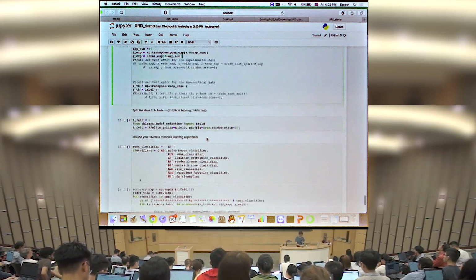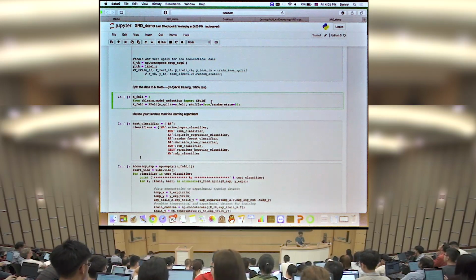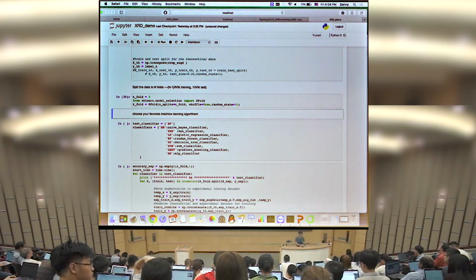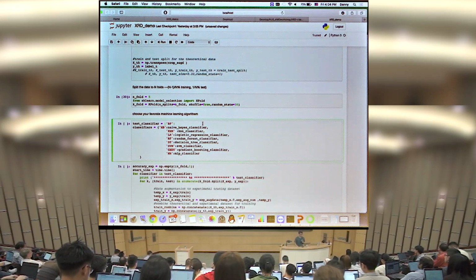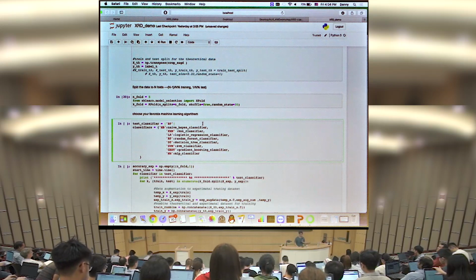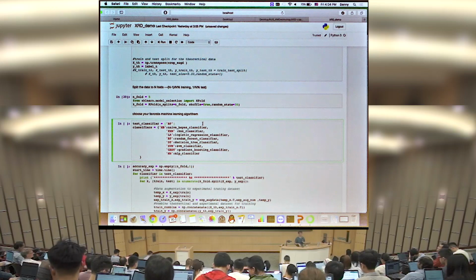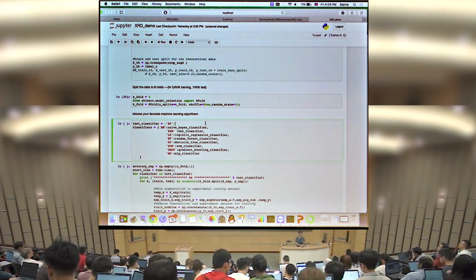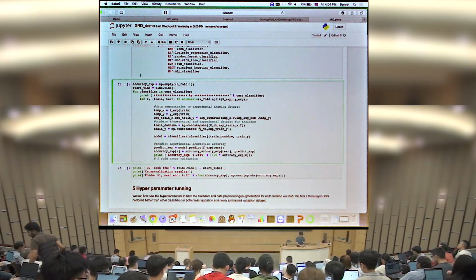Okay, so let's put all the data into the classifier and specify the number of folds for the cross-validation. In this case, we will do a 5-fold cross-validation. And we don't know what is the best classifier we can use. So here there's a list of classifiers, and you can choose based on your own choice. And later, of course, you will pick the one which gives you the highest accuracy. For this case, let's use random forest because it runs fast. Okay.